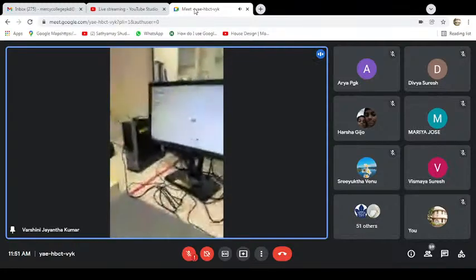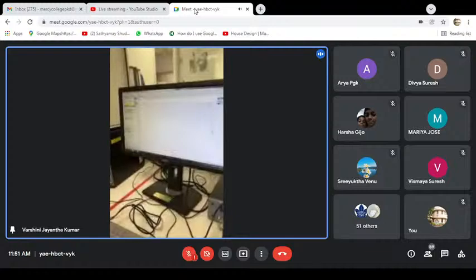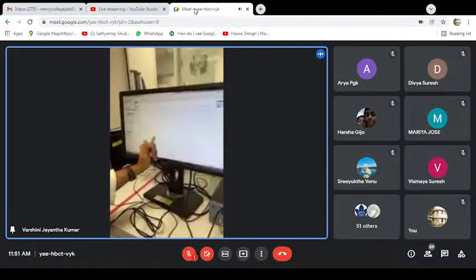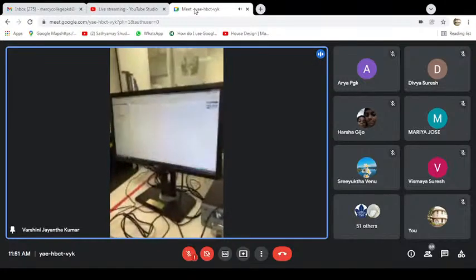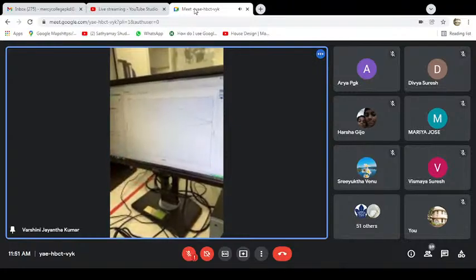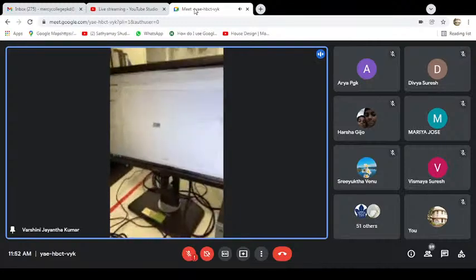So right now I'm going to apply the potential and run a cyclic voltammogram. So what happens is that once I click start, the instrument starts scanning the potential. It scans the potential all the way to the positive side and then scans it back to make a cycle. And that's why we call this cyclic voltammetry. So the axis is current versus potential. Like I said, it scanned the positive potential and then came back and scanned the negative potential to give this nice and beautiful cyclic voltammogram.